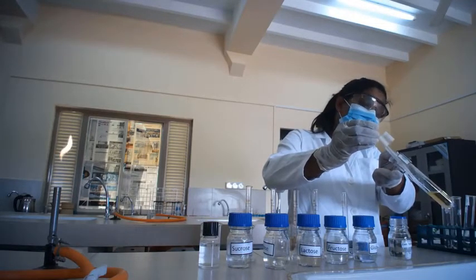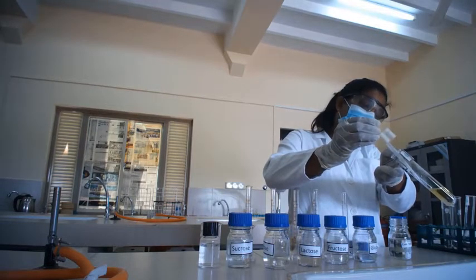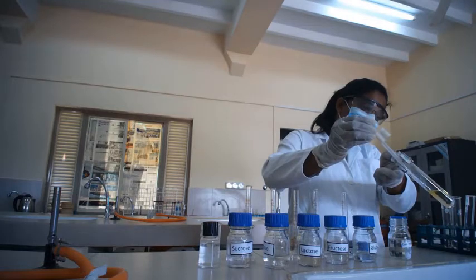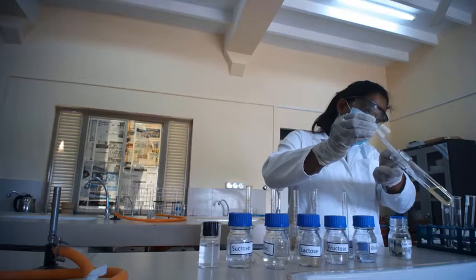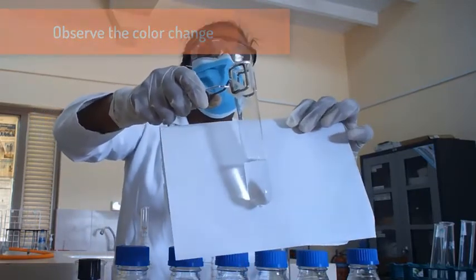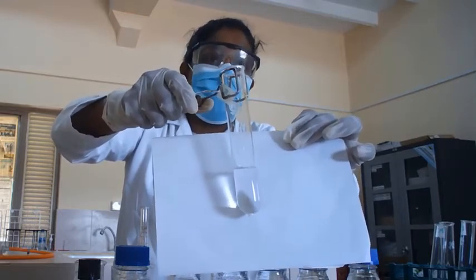Gradually, the color of the solution is going to fade and it will become colorless. So now you can see the yellow color of the solution has become colorless after adding concentrated sulfuric acid.